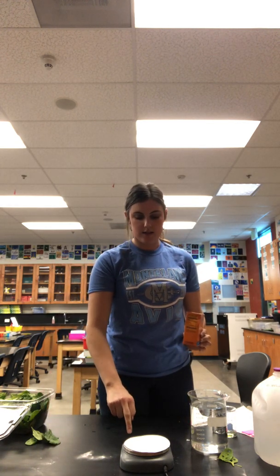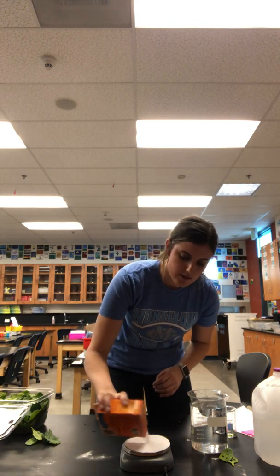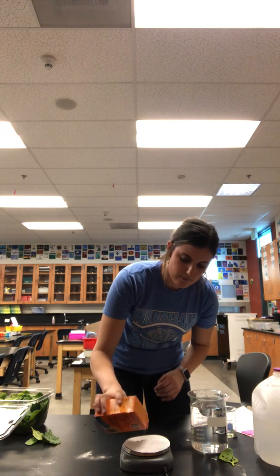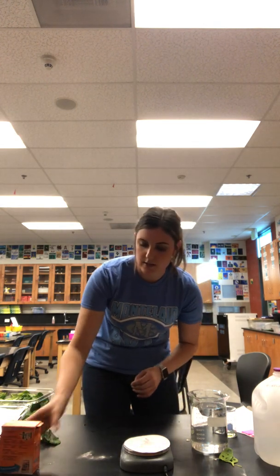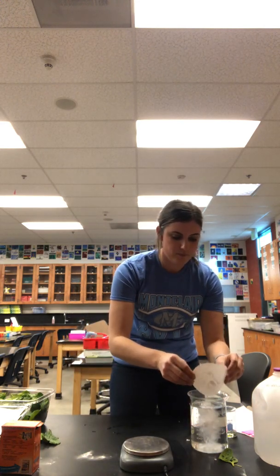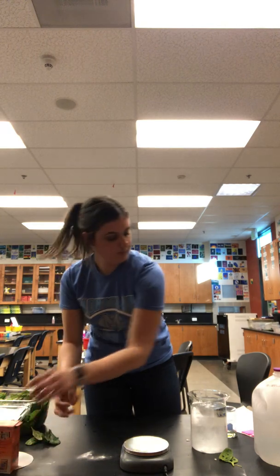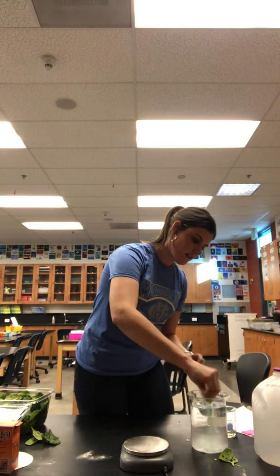First I've got to zero the scale to be sure I'm getting an accurate measurement. Like I said, 10 grams into the 1,000 mils of water to get a 10-to-1 ratio. Stir that up with your plastic stirrer.